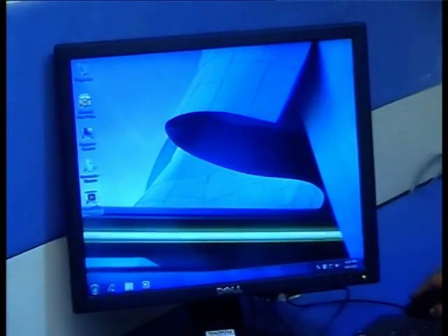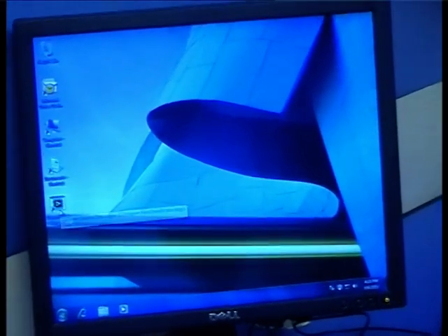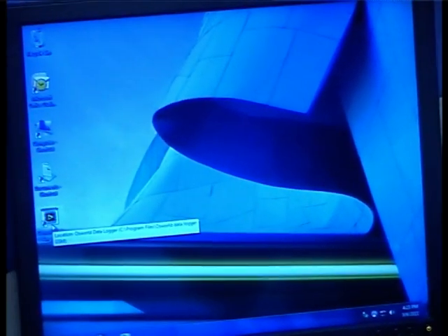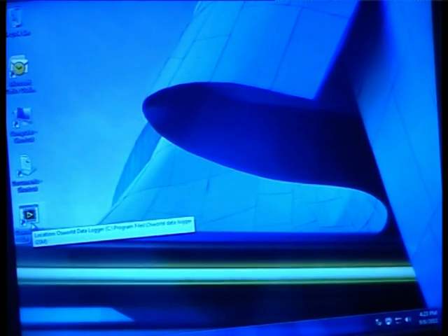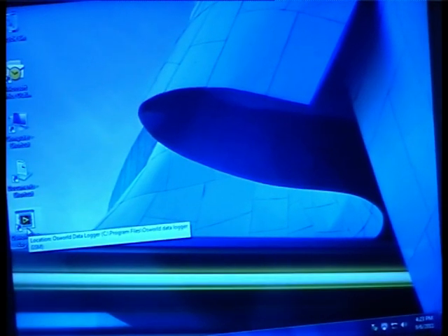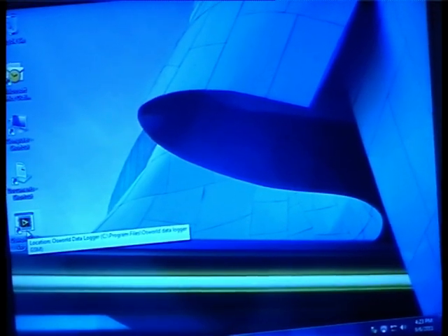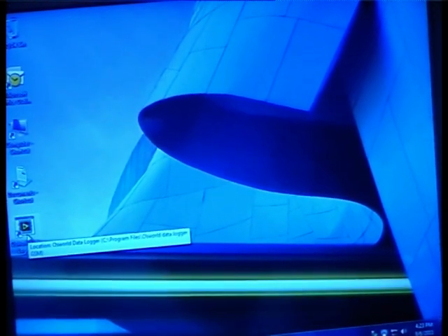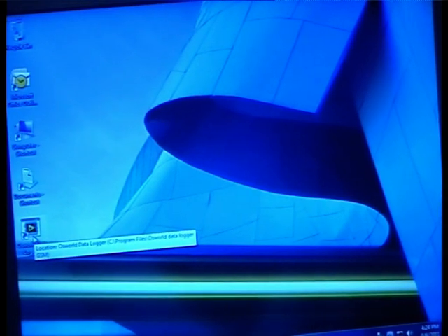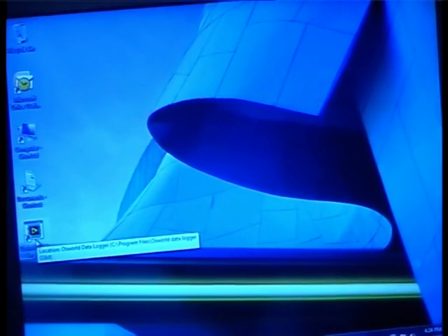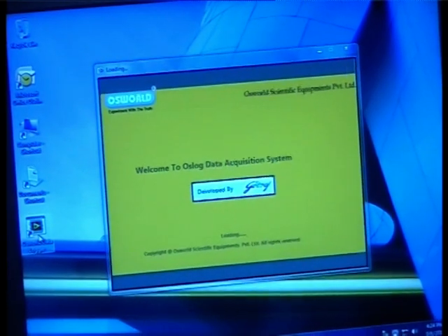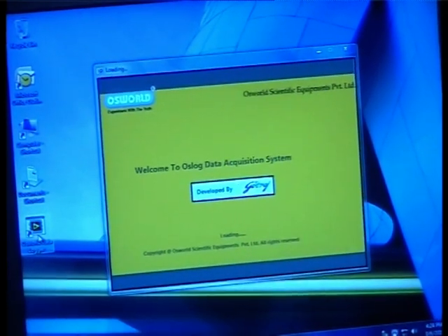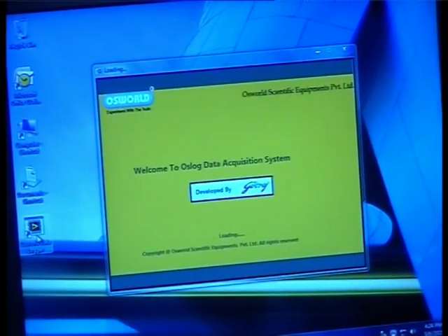How to login: We provide you with an installation CD of the Oslox software along with your Osworld equipment. Once the software is installed on your PC, you will observe the Osworld data logger icon on your desktop. Click on this icon and the Oslox software login screen opens up.